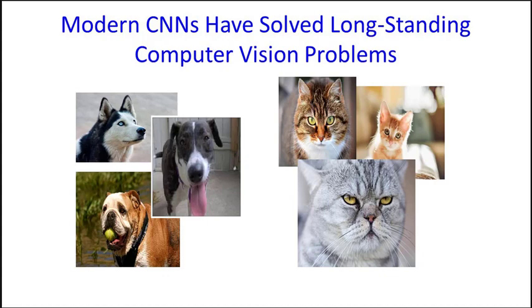And so what did it do? Before in computer vision, this was a long-standing problem. People thought that it would be hard for a computer to distinguish reliably between a dog and a cat. And why is that problem hard? I can show my 3-year-old a couple pictures of dogs and cats, and they will be able to extrapolate what another new picture of a dog or a cat looks like. For a computer, that was hard in the past when you didn't use convolutional neural networks.